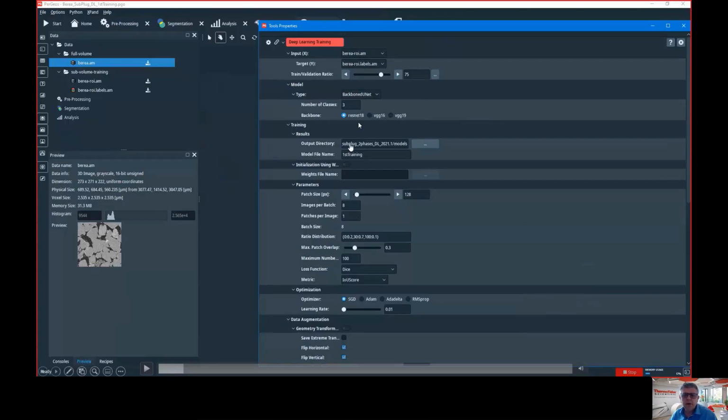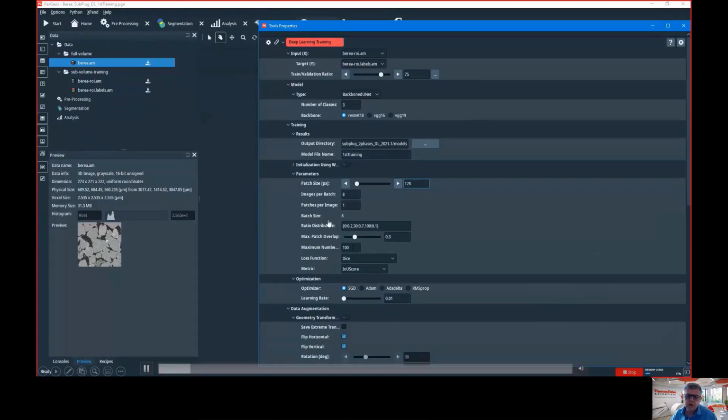Let's say first here you give a name to the first training. You call it first training, and you have to select something. And this is maybe a parameter: you will run only a few epochs. Deep learning is a converging process in principle. You learn from one step, you go to the next step from the previous one, and so on. If everything is well done, you will see the precision getting better and better, and so you know that you are on a good path. If not, it's going to diverge, and then you have to stop and change something.